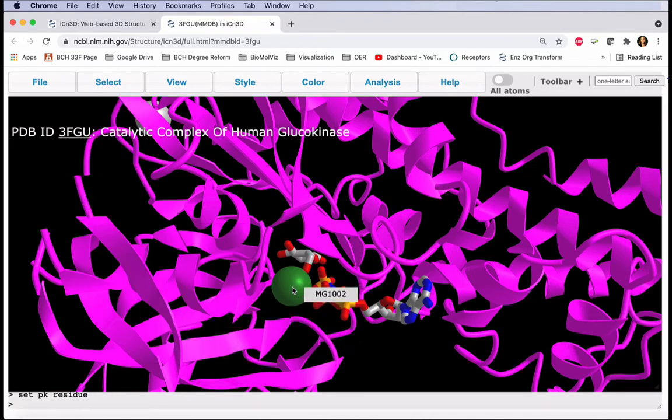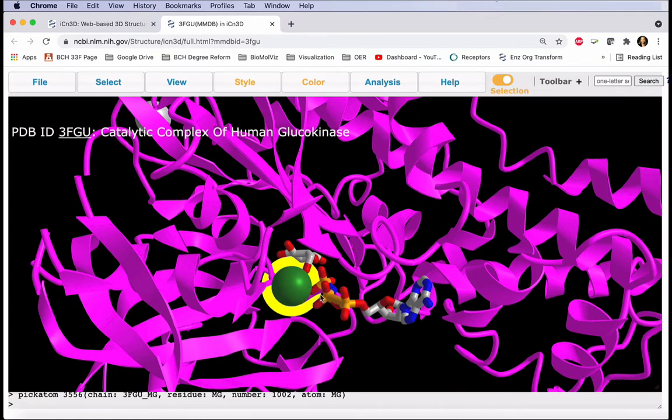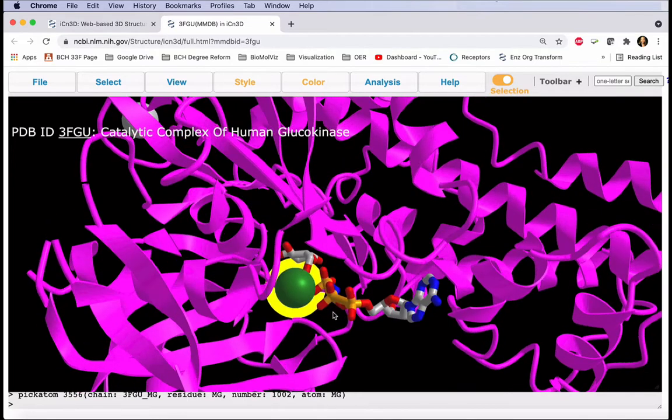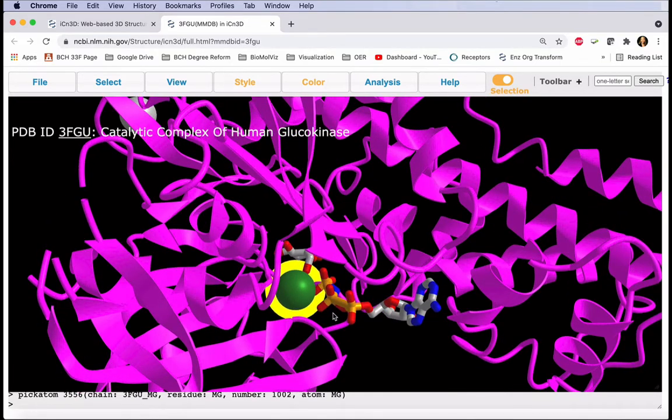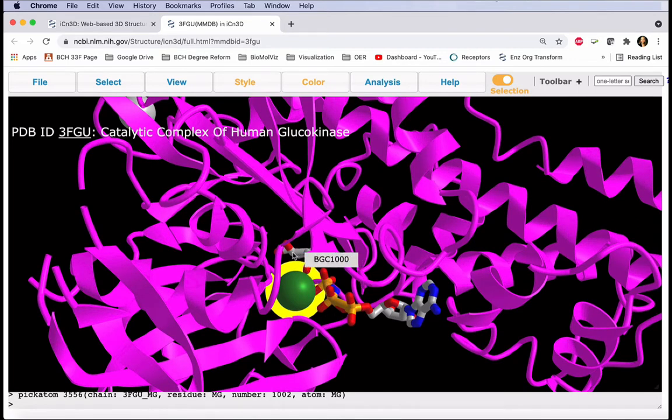Now I'm going to, on a Mac, option click on my magnesium. I may need to reposition this to click on my other residues. And now holding down control, I'll click on this residue.